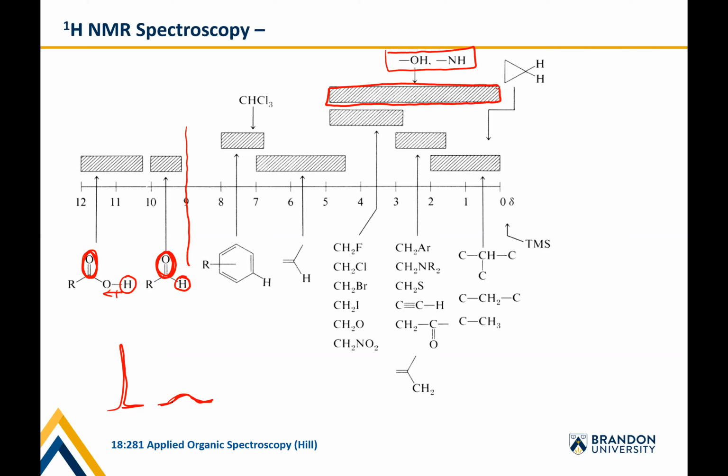So you can often tell if a proton's bonded to a heteroatom like nitrogen or oxygen specifically, if it comes out as a blobby shape. A carboxylic acid up in this zone will be, for lack of a better word, a blob, and an aldehyde would typically be a sharper peak. But we'll get into why heteroatoms have this wide range a bit later on in the class.